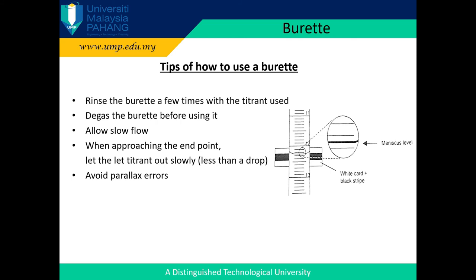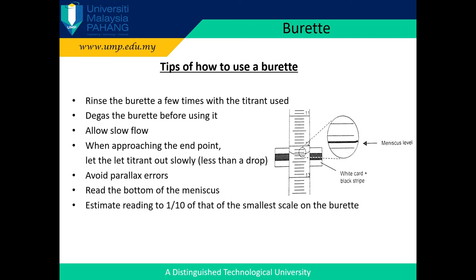Avoid parallax errors. Read the bottom of the meniscus. Estimate the reading to 1 over 10 of the smallest scale on the burette. Consider the thickness of the scale lines when reading the burette.